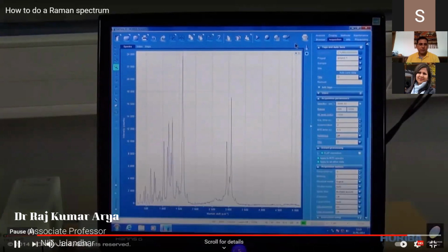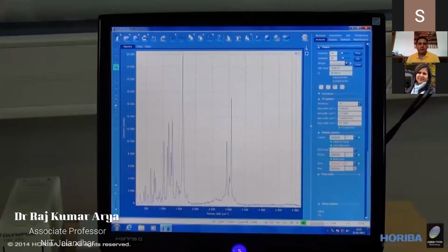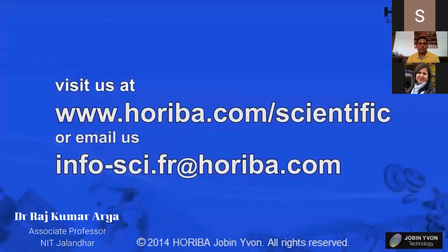So you can change here the acquisition time, actually 2 acquisitions or 10 acquisitions. In case of weak signals from the sample, or let's say very low concentration, you can give it a higher number of acquisitions, maybe 10, so that you should get very sharp peaks without any noise. That would help in that particular case. For further spectral analysis, we can follow, for example, the band maxima. But follow us in the next how-to on the spectral analysis, coming soon.